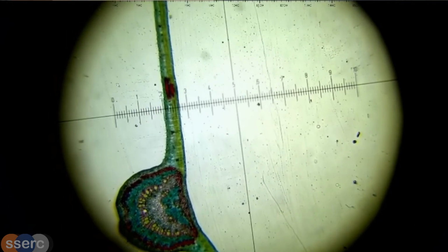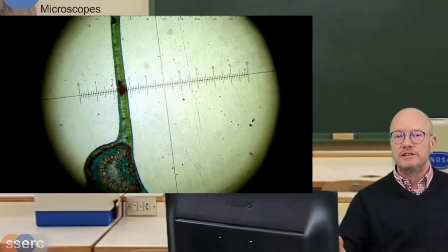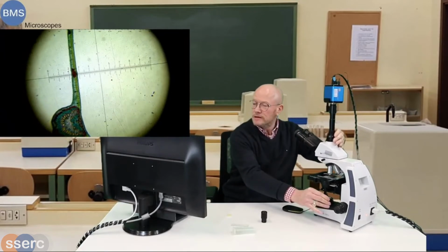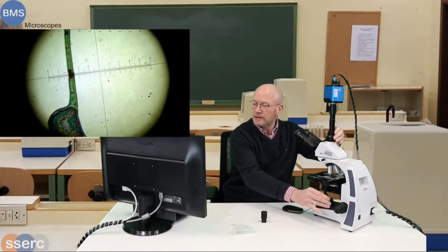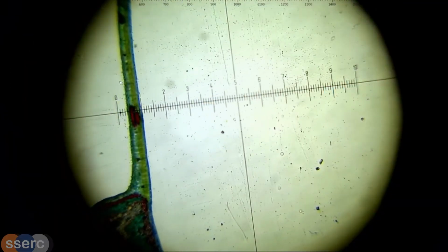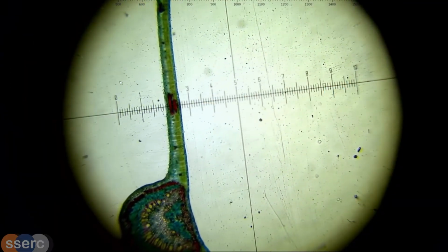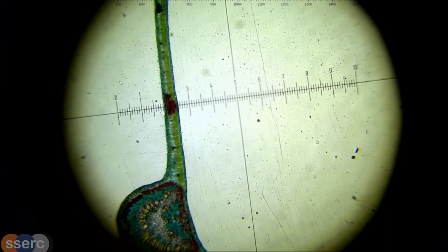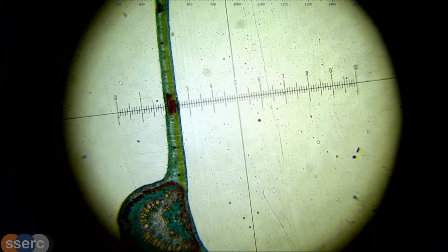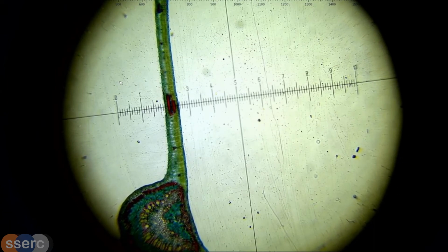You don't have to start all the time with 0. If I start here with 2, then that is my 0 point. By rights, you can start with 0 as well, right here. But normally my focus is a bit better in the center of the image, rather than on the rim of the image.